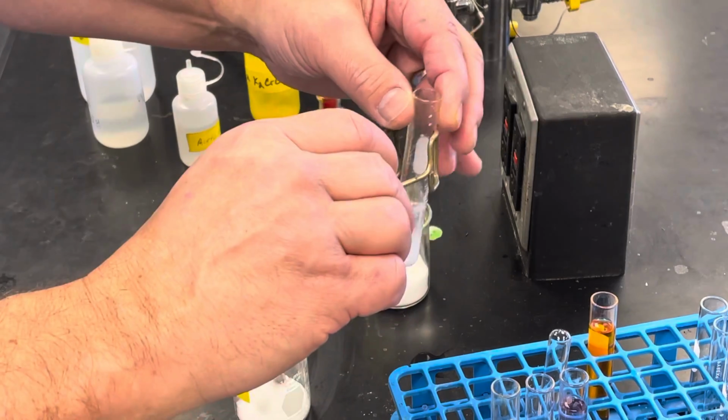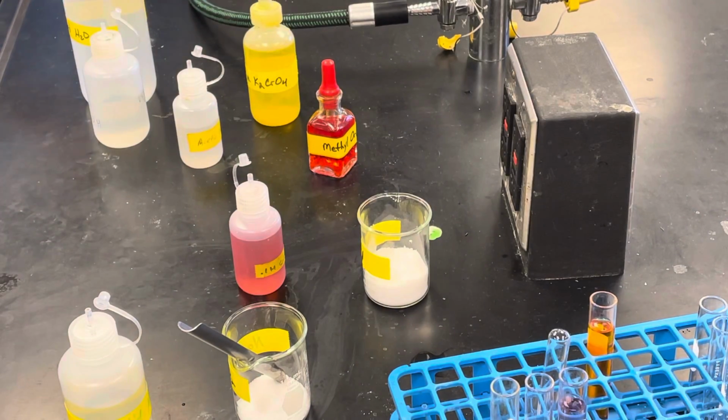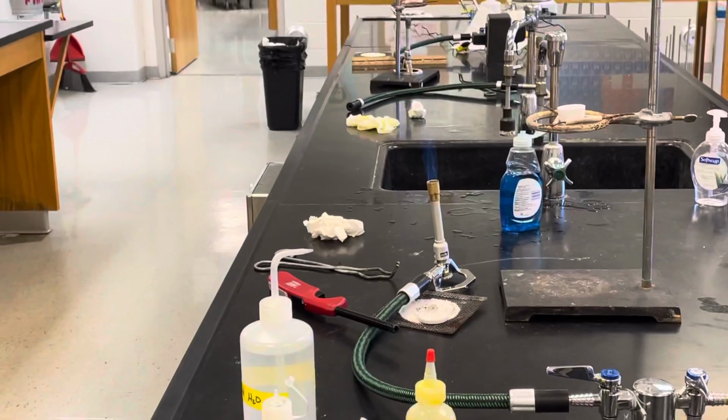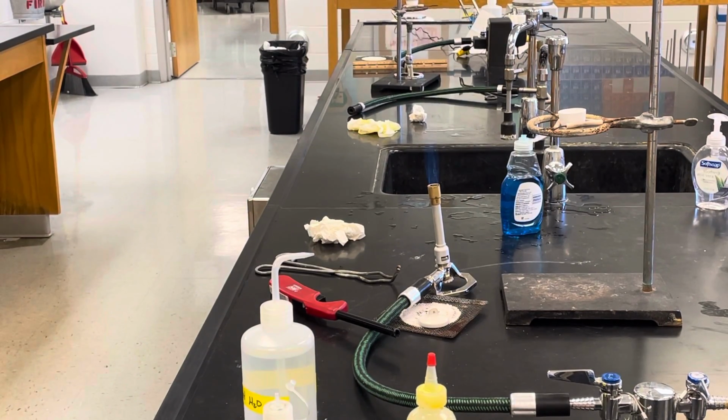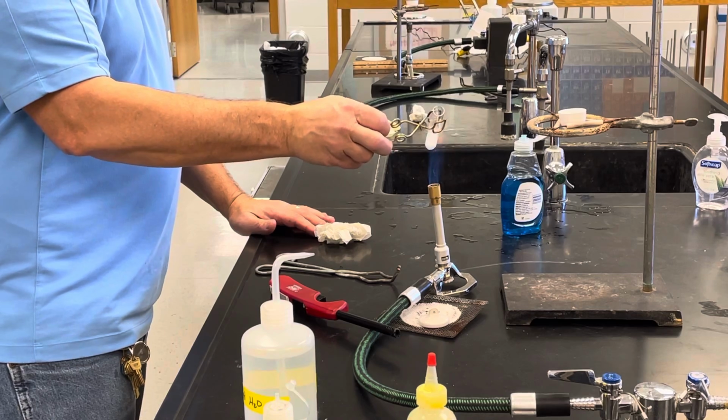Now, I'm supposed to have some boiling water, but I forgot to get the water going. In class, they put it into boiling water, but I'm going to put it over just the burner. I'm just going to heat it up a bit. Okay?